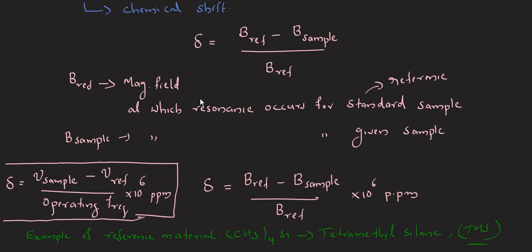So we need a reference sample, and usually a standard material is used as the reference sample. It is tetramethylsilane, (CH3)4Si, which is named as TMS.